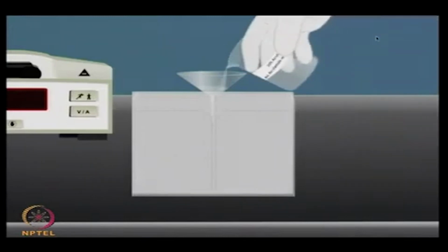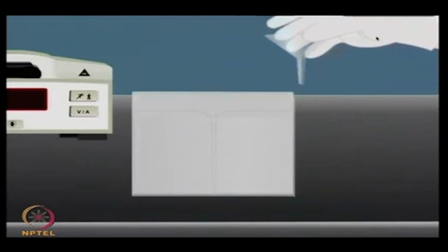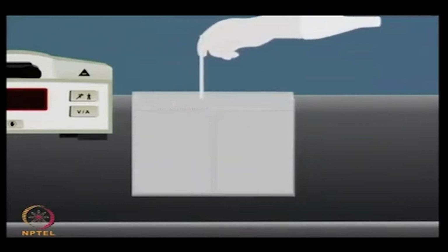So, SDS-PAGE, which constitutes the second dimension of two-dimensional gel electrophoresis, involves assembly of the gel apparatus, gel casting, equilibration of the IPG strip, followed by placement of the IPG strip on the gel and protein separation. So, prepare the gel casting solution consisting of acrylamide, bisacrylamide, Tris chloride, SDS, APS and TEMED.